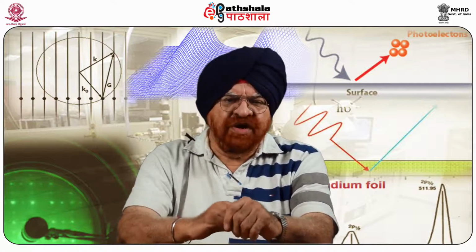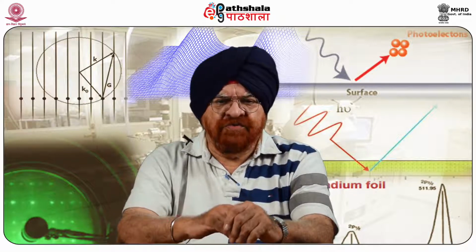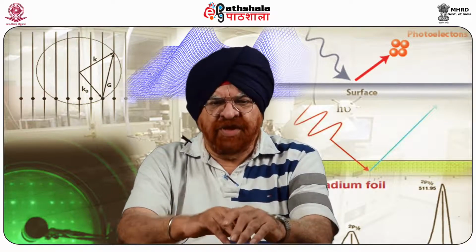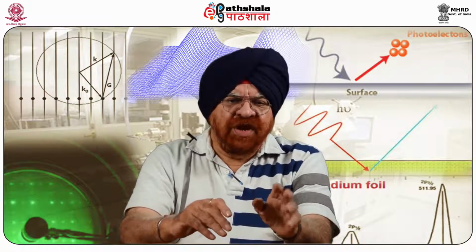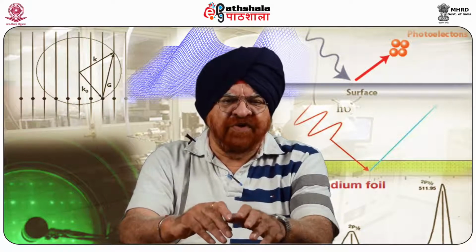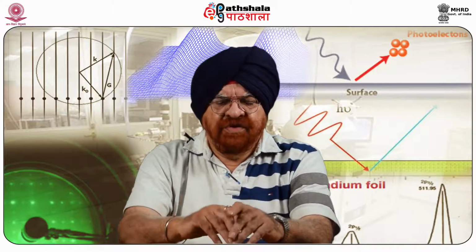When two different conductors are brought into electrical contact, for example via an external wire contact or by another means, the electrons will flow from the one with lower work function to the one with higher work function.